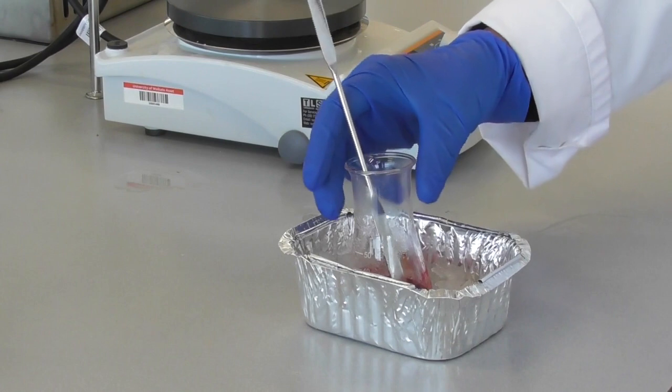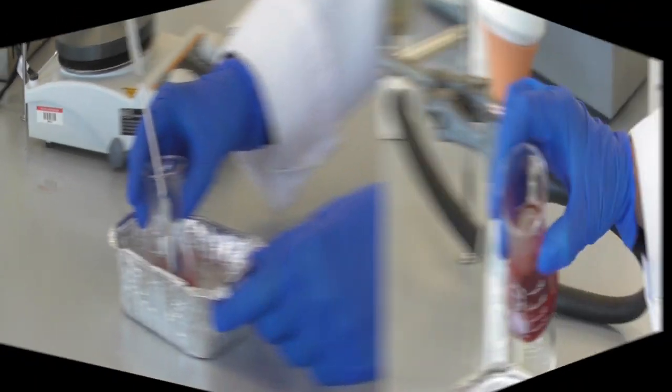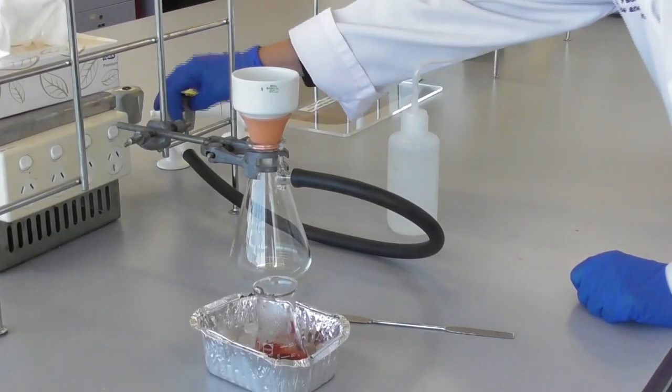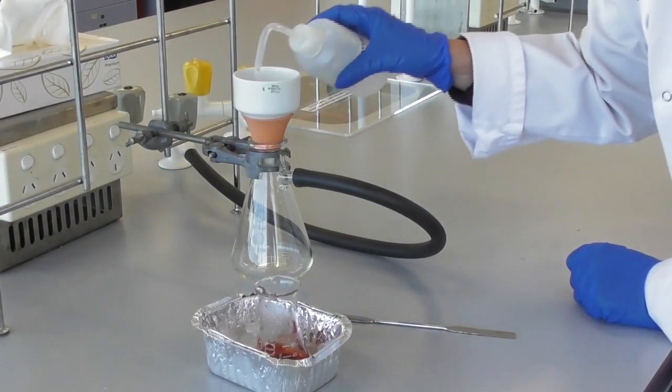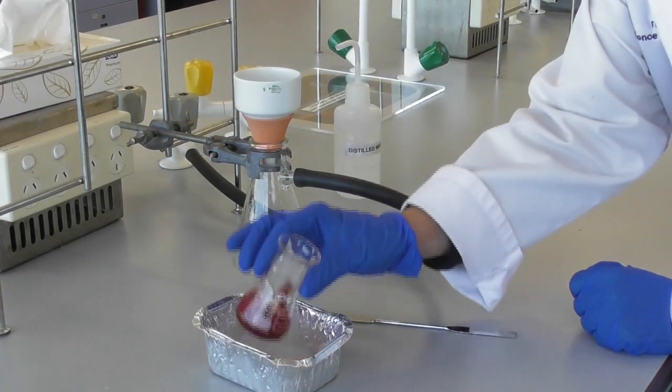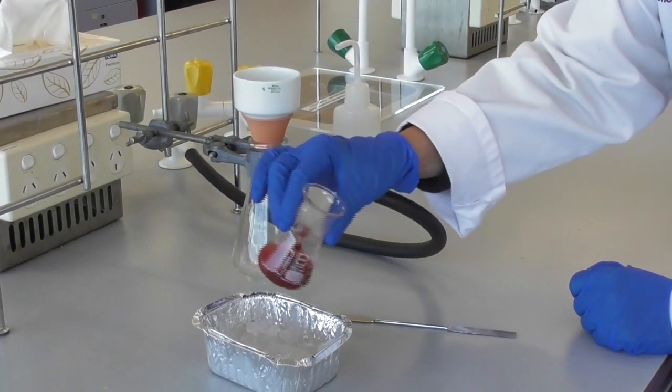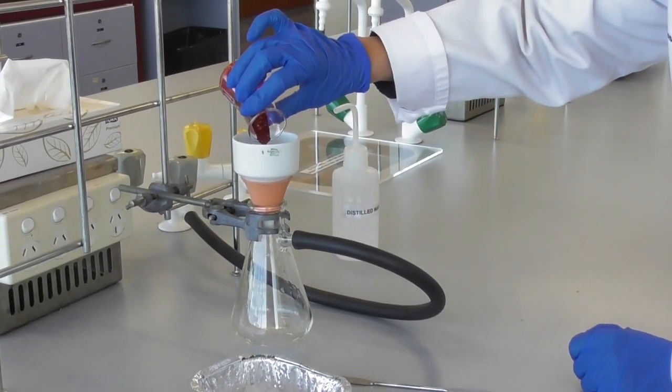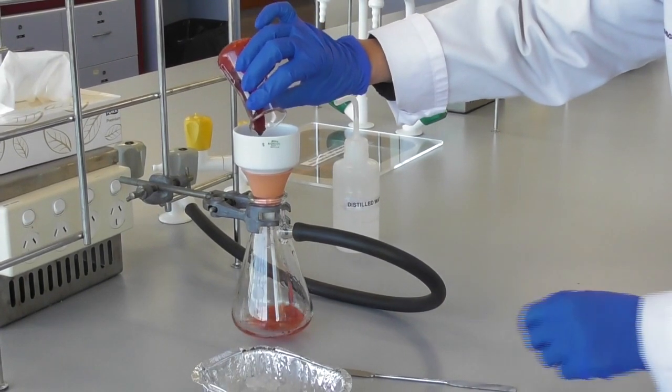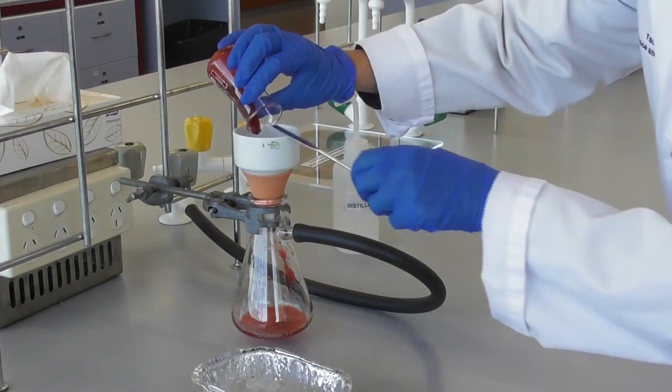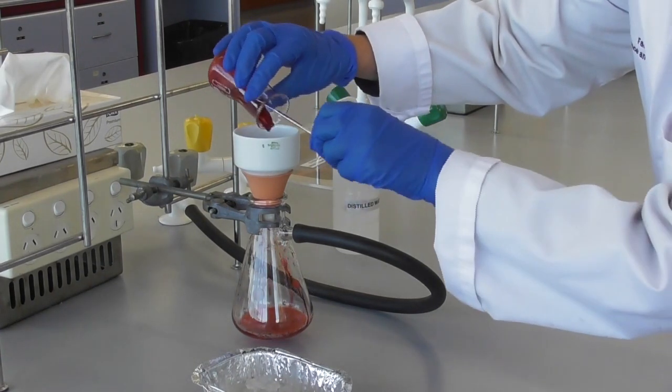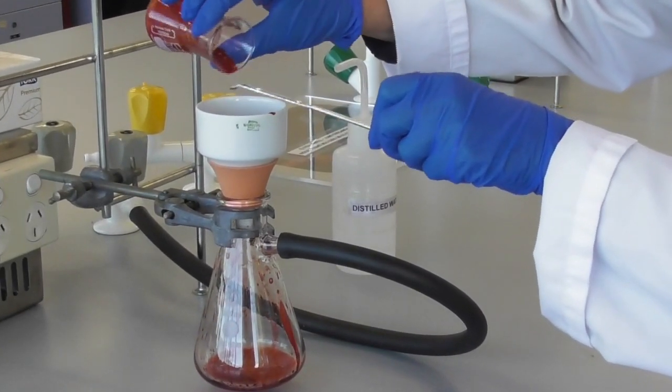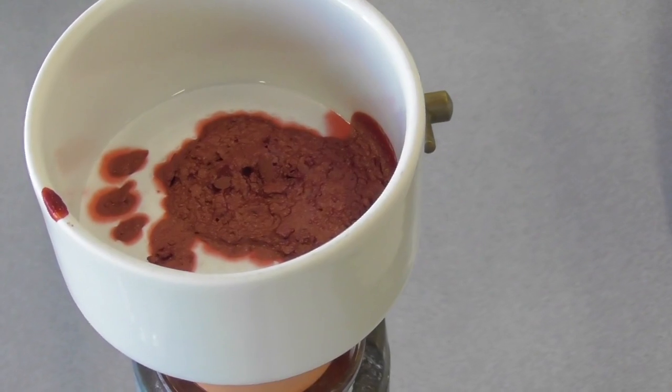To help the mixture cool off we put it in an ice bath. Once it has become thick again and we have precipitate in the solution we can filter our product. We wet the filter paper with distilled water and then pour the thick mixture into the Buchner funnel. To ensure good yield we scrape out some more of the product into the funnel, and then we let it sit on the filter paper with the vacuum running.